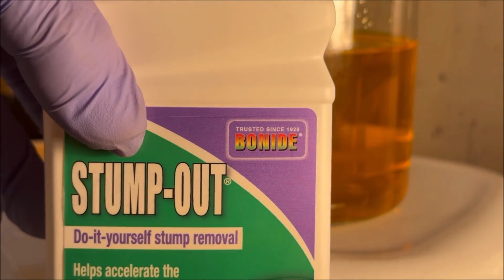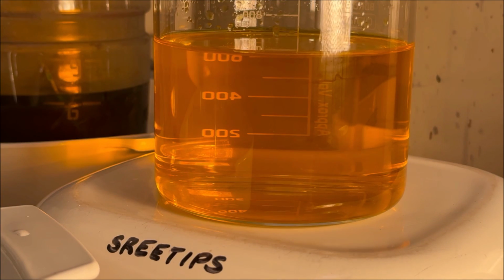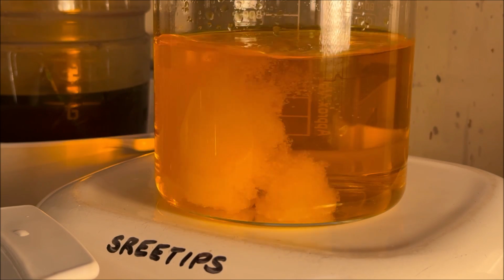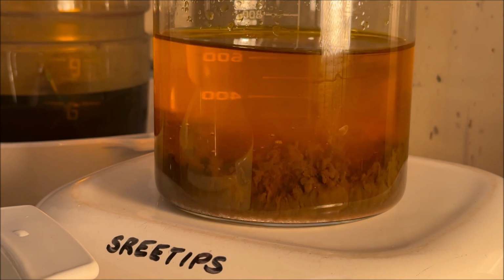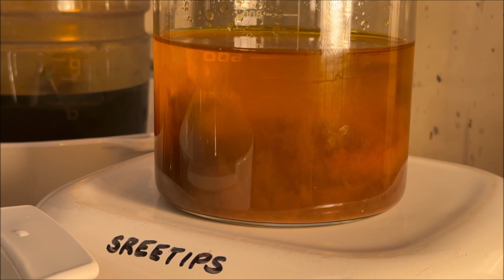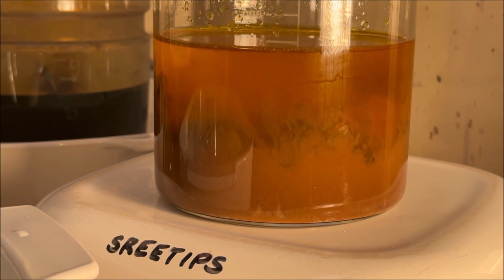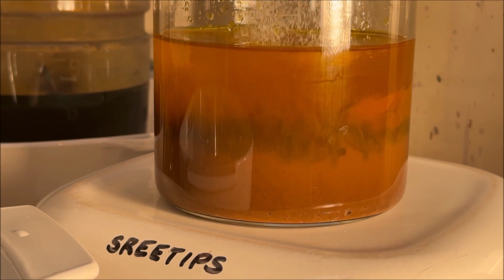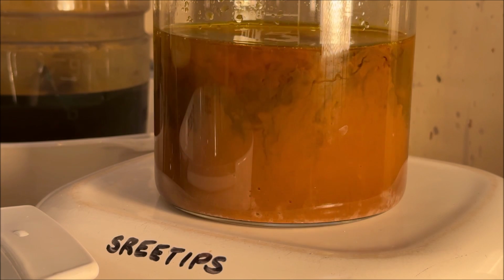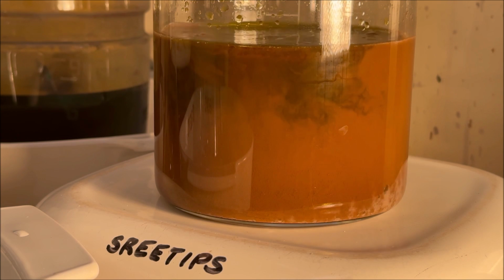Let's go ahead and put some stump out in here now. Stump out is sodium metabisulfite. I'm going to precipitate out the pure gold with stump out. Put in another spoon. And one more spoon. Maybe another half one. This should do it. There's only about 40 grams of pure gold in here, so this should do it for us.